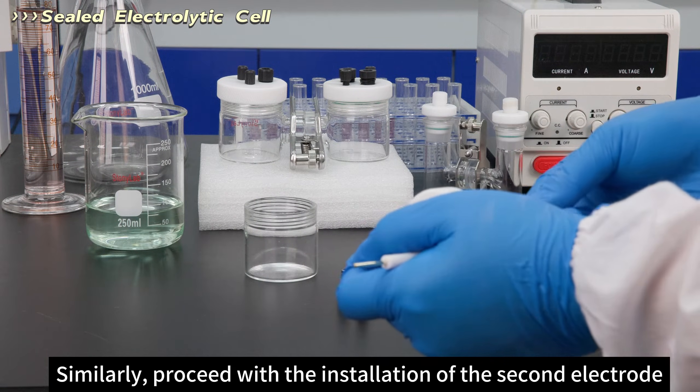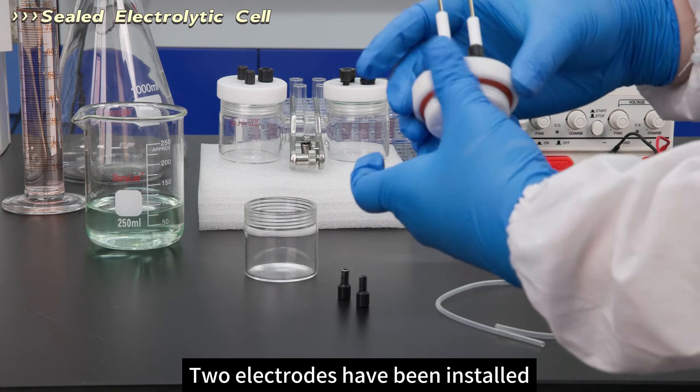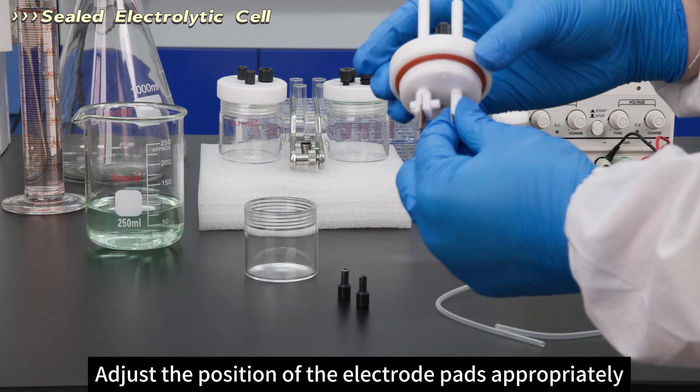Two electrodes have been installed. Adjust the position of the electrode pads appropriately.